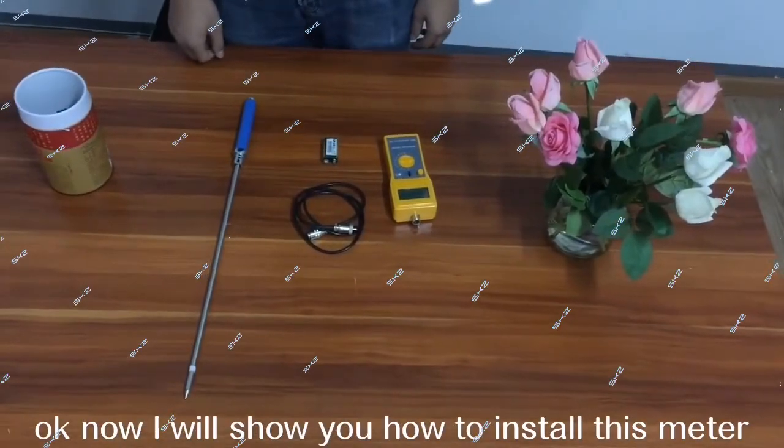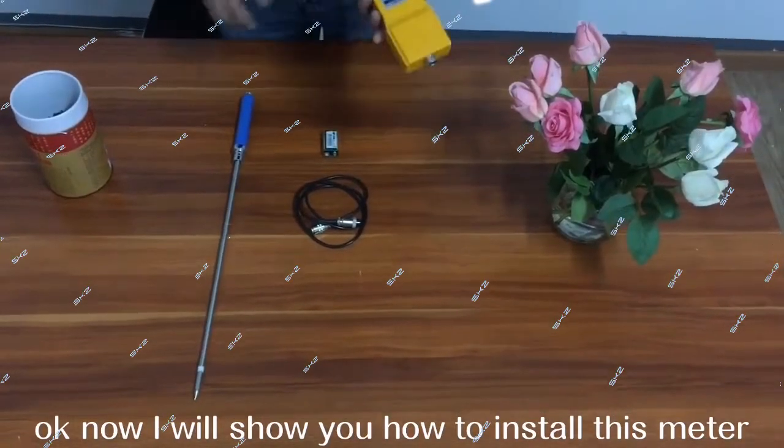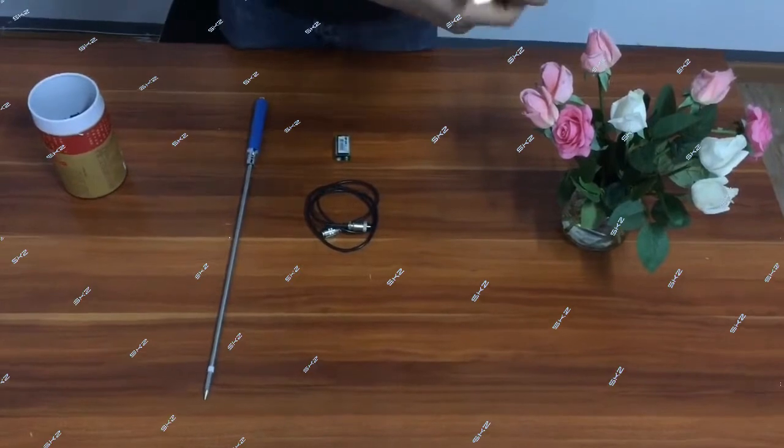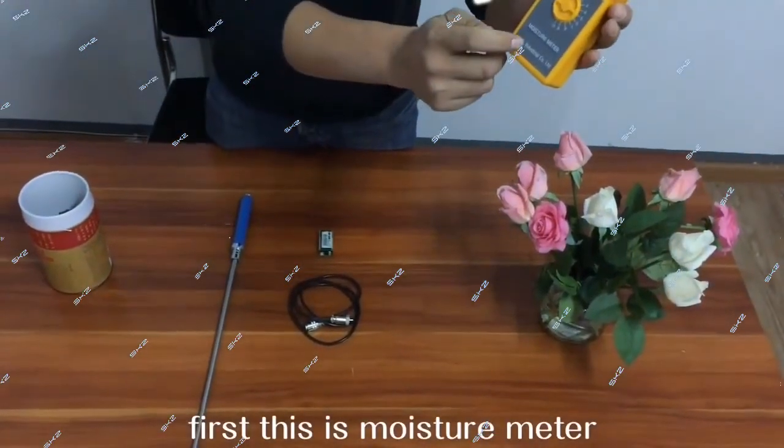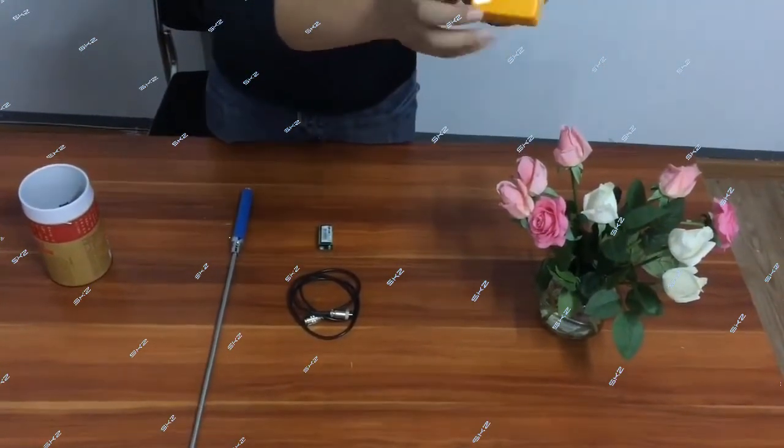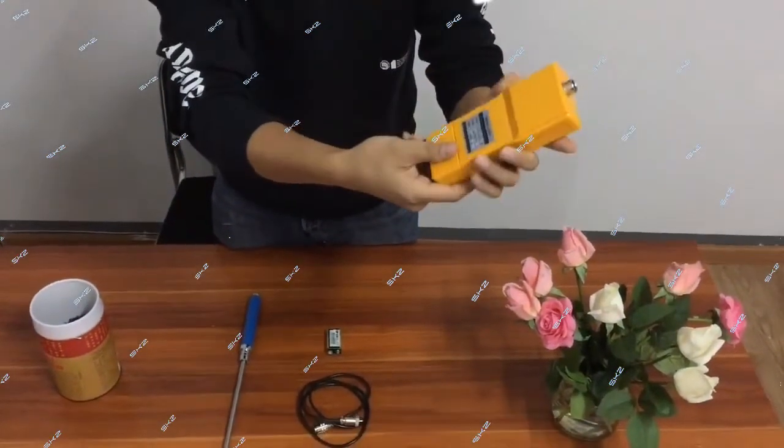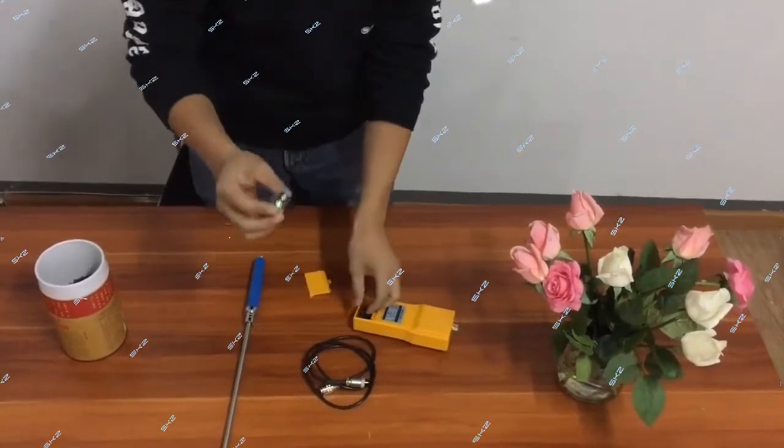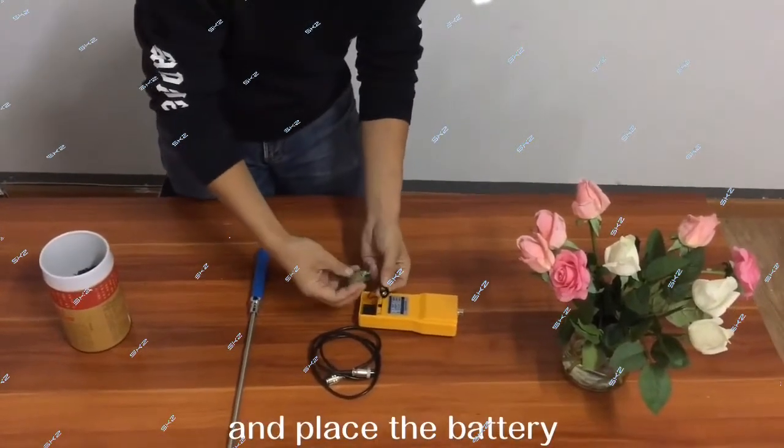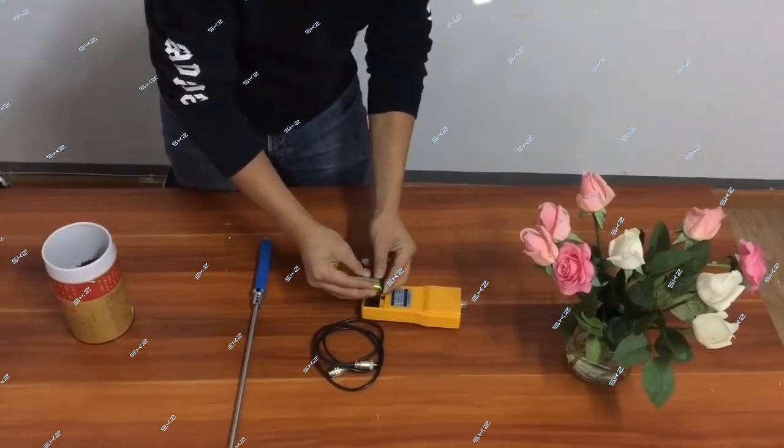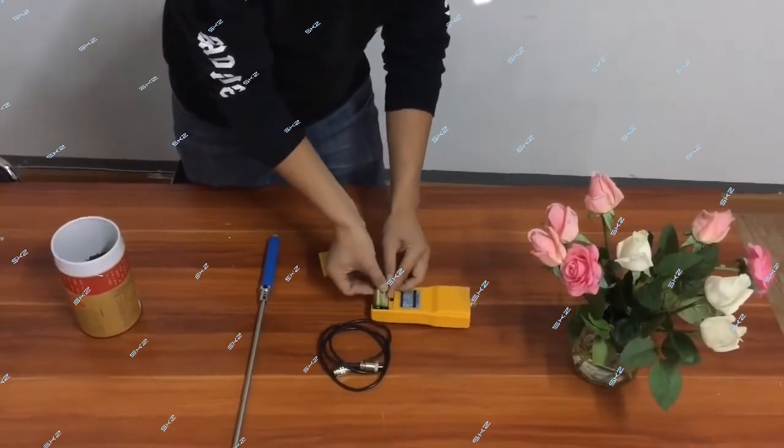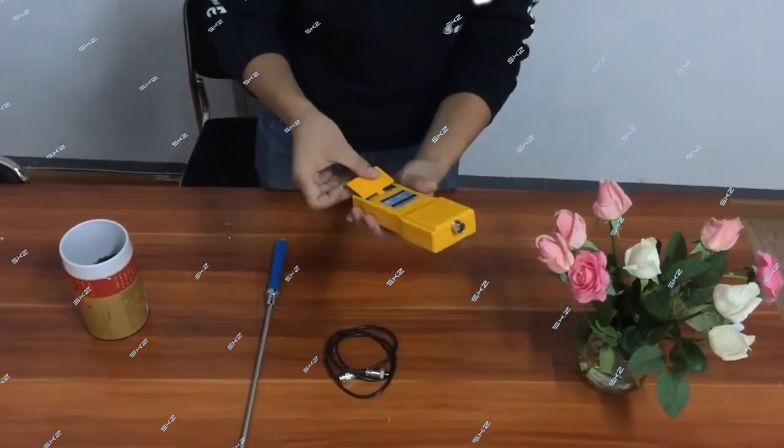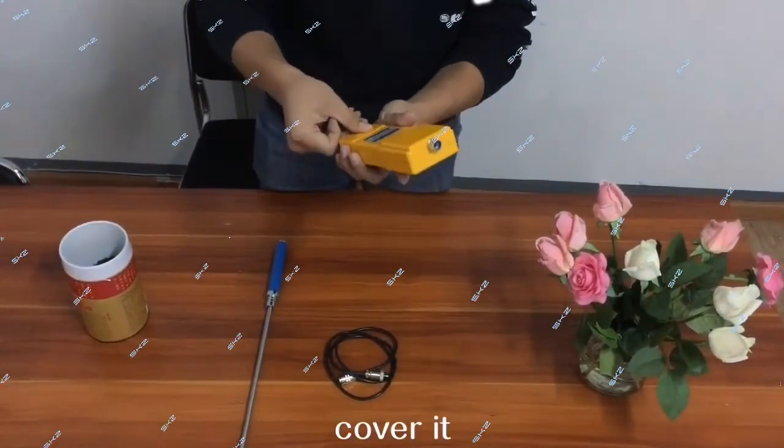Now first I will show you how to install this meter. First, this is the mass meter. And here, the name card. Open the back. And I fix the battery. Cover it.